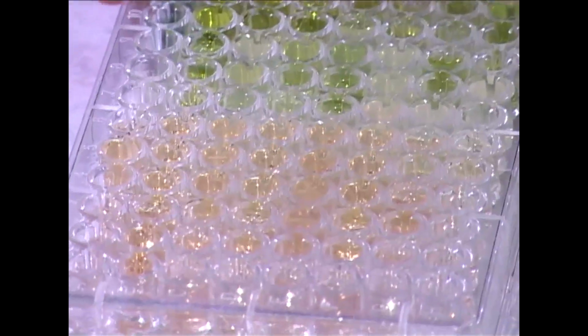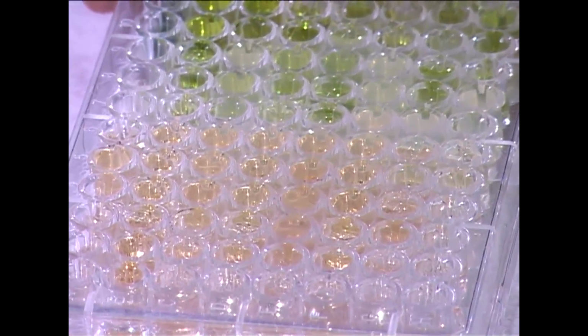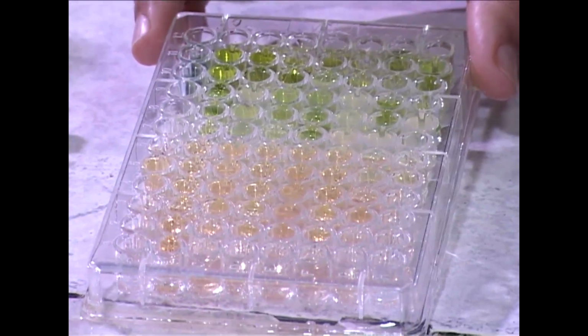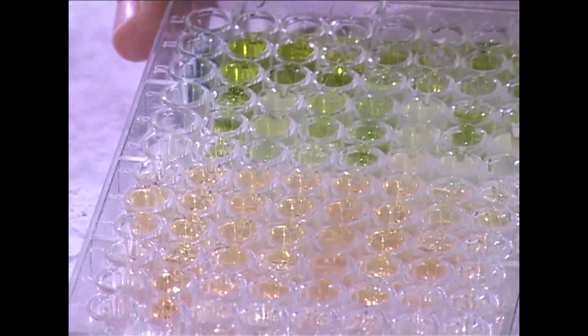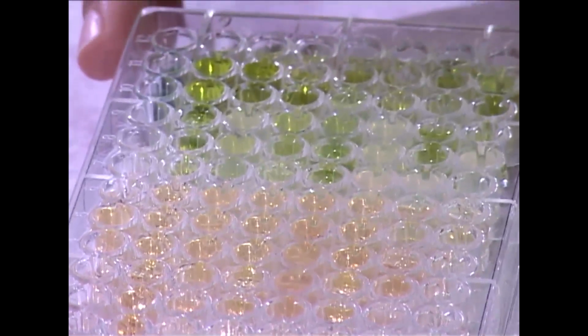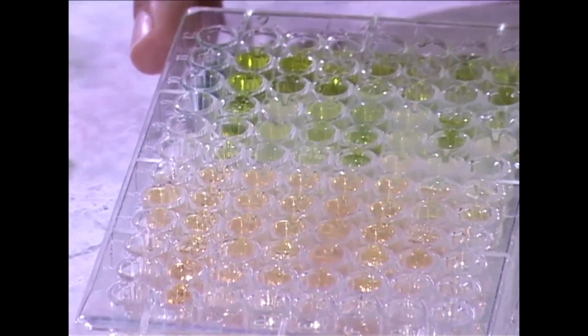Okay. Now color intensity is measured in an ELISA reader. The extent of intensity depends on the amount of antigen present in a well. These wells look white, which means no antigen is present in them. Whereas these wells contain less antigen, and these wells with intense dark color mean the amount of antigen is more.